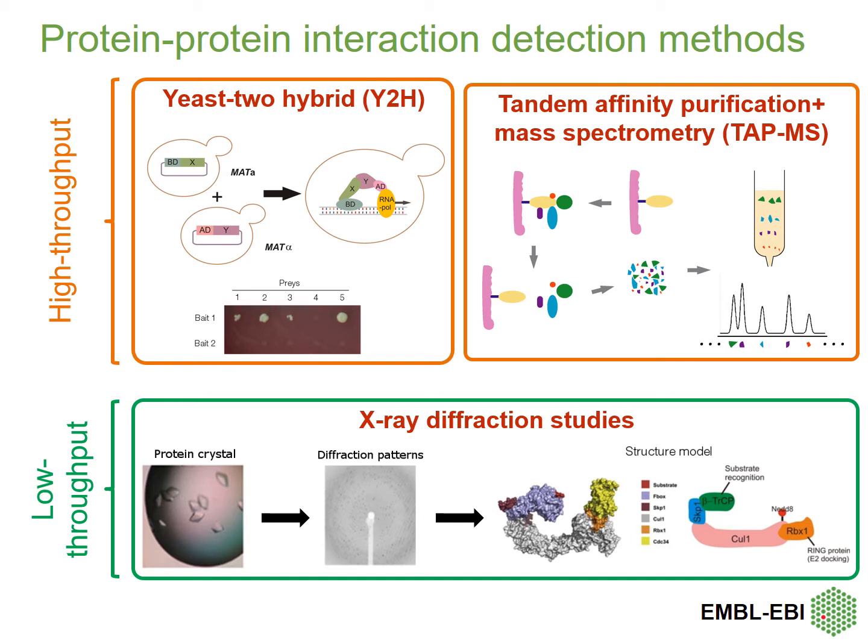So that's in a certain cell type, a certain disease condition, and you could test this interaction under other conditions. Will you bind all four of these or not? Maybe it doesn't bind any under certain conditions. It's just good to know, and this data is collected here.